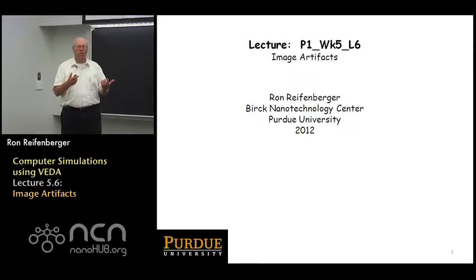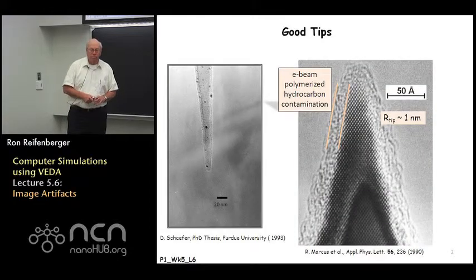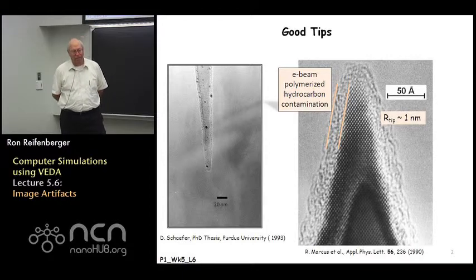So that's the central theme of this lecture: things you have to worry about, maybe work through occasionally, just to provide sanity checks that you're in fact obtaining good data, good information, and that you're not over-interpreting the results that you obtain. I would encourage everybody to occasionally take SEM photos of your tips, both before and after you use them. You can learn an awful lot from these images, and I just show a few examples of some good tips.